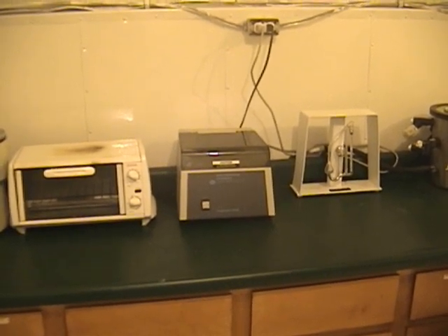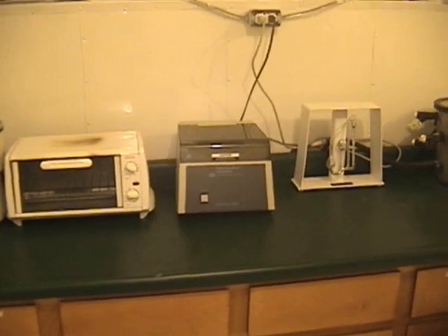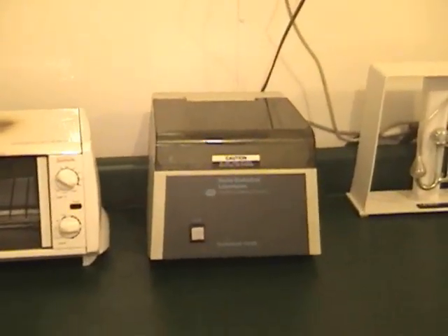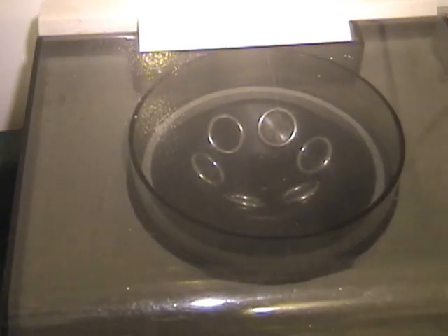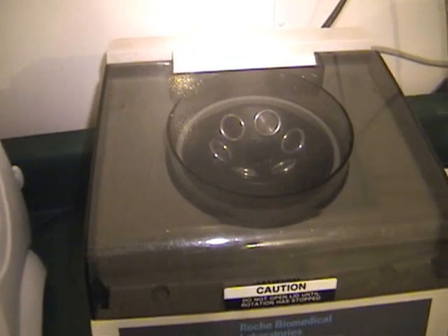This is a centrifuge, and basically it's used to remove any bacteria, cellular debris, or anything that you don't want in the venom. Anything that's heavier than the actual venom itself will just be pulled to the bottom, and then you can clean it up.